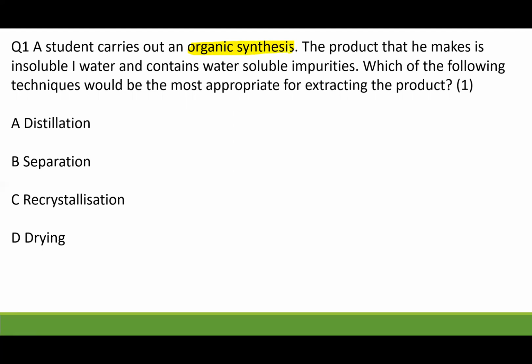The product that he makes is insoluble in water, and it contains water-soluble impurities.